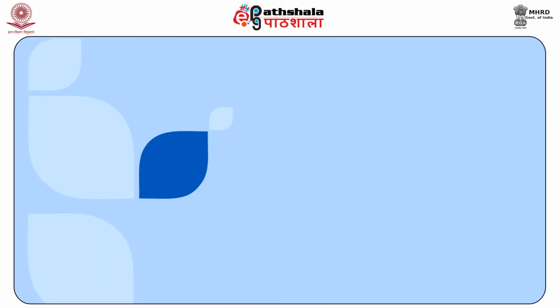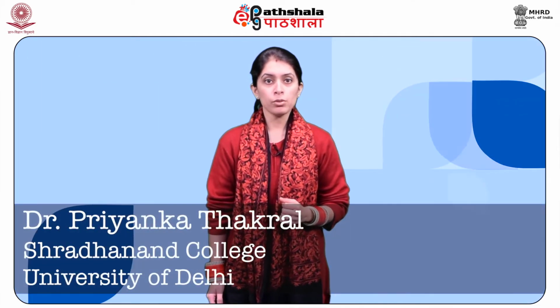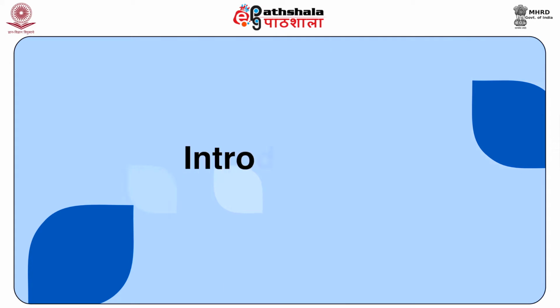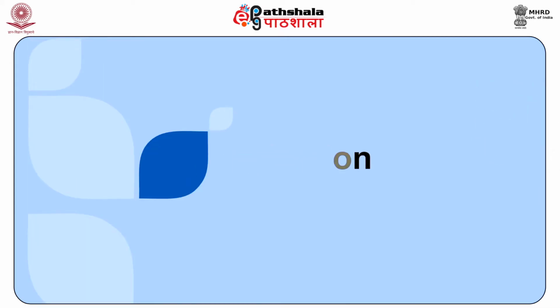Learning outcomes. After studying this module, you shall be able to know about formation and stability of inorganic complexes in solutions, and optical methods for obtaining the stoichiometry of a complex, that is, determination of the composition of complexes. You will also learn about Job's method, and also the limitations of Job's method.